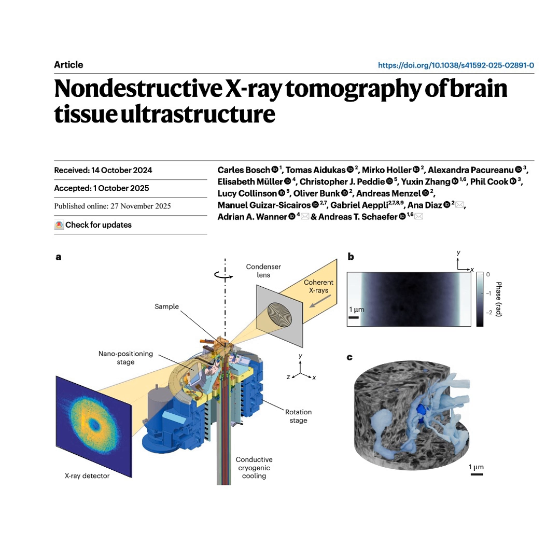All right, another quick recap. The full synergy is this. The nuclear-grade TGPAP resin and the cryo stage let them survive the massive X-ray dose. Then, the non-rigid computational reconstruction cleaned up the leftover deformation, delivering 38 nanometer resolution. Right. Enough to see the synapses. It's a monumental feat of engineering.